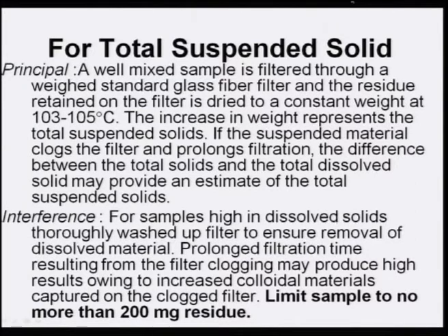Here the interferences are: for samples high in dissolved solids, thoroughly wash the filter to ensure removal of dissolved material. Prolonged filtration time resulting from the filter clogging may produce high results owing to increased colloidal material captured on the clogged filter. Here also the limit is that it should not exceed 200 milligram in the residue. Now, these are different parameters in water which need to be tested for its purity content.